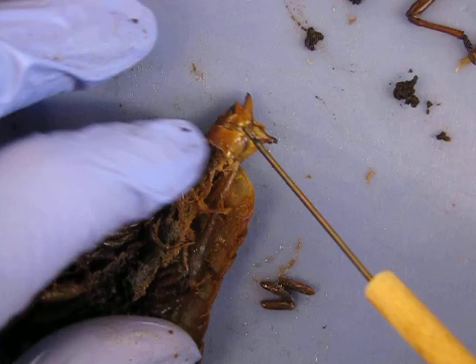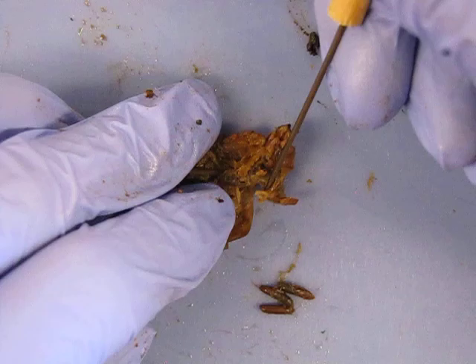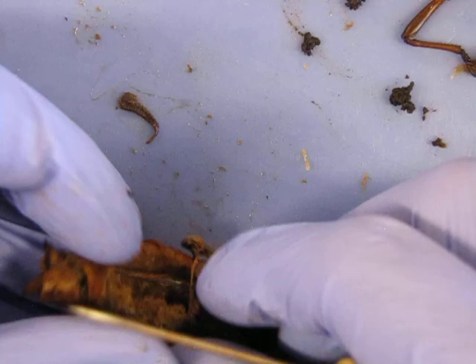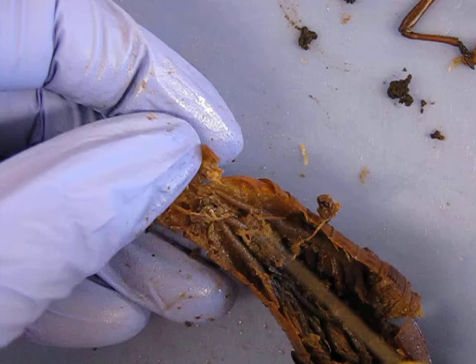After the eggs are produced up here, they'll travel down the oviduct. Down here, after mating, there should be a seminal receptacle somewhere where the sperm will be stored. Sometimes it can be hard to tell the difference between structures — just trace what you can. I know that's still intestines because on either side is oviduct, so this can't be the seminal receptacle here because it's actually part of the digestive tract.